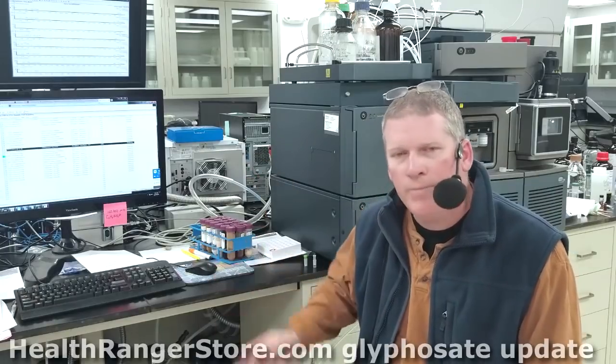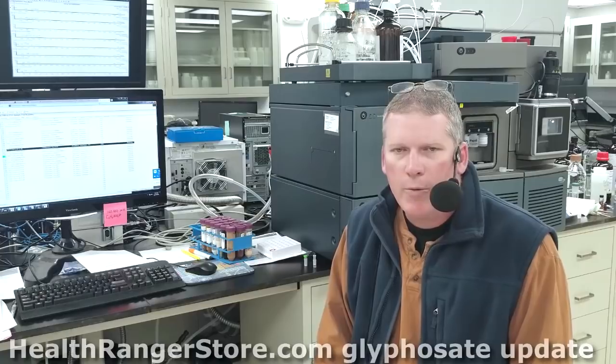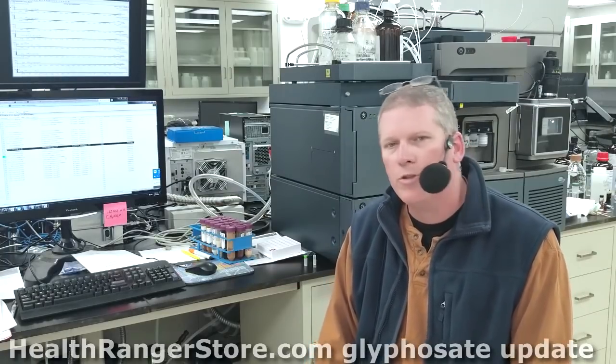We put that into the system. We run the chromatography, the mass spec. We do a back calculation on the dilution, and we can calculate how many picograms or nanograms of glyphosate are in the original food. And so far, I'm happy to tell you that the answer has been 0 for everything that we've tested so far from our store. 0. And of course, if we see something coming in as a raw material, if we see glyphosate, we're going to reject that because we don't want anything in our store to have glyphosate in it.